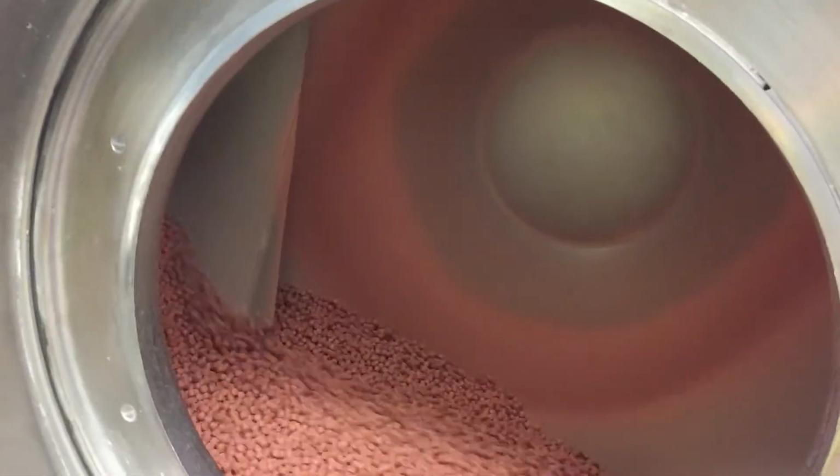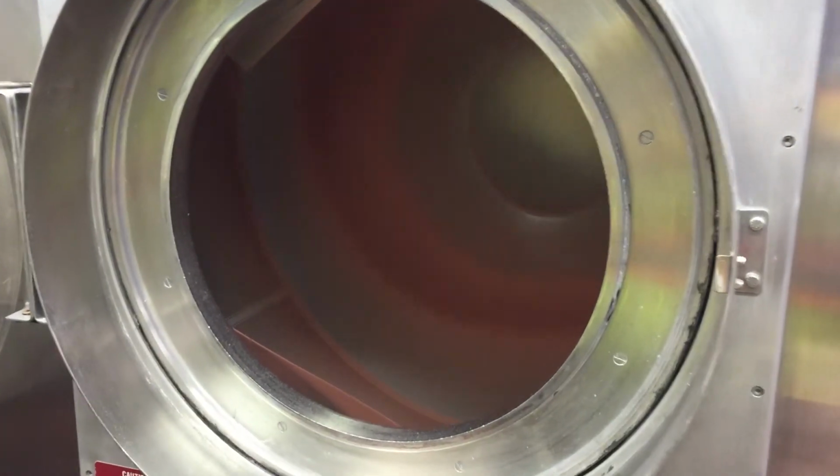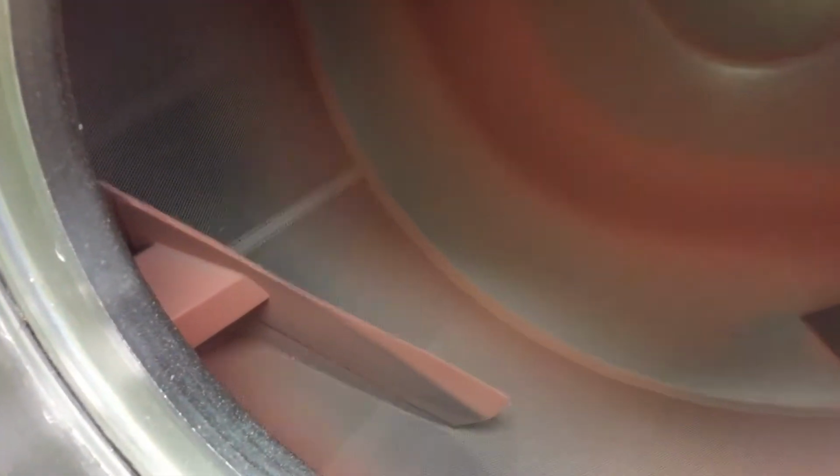We've got a really well coated pan as well as tablets. So what we have done is we have managed to get a coating which looks like a 3-batch coating, and the residue looks like how it would look in an original coating pan in production.